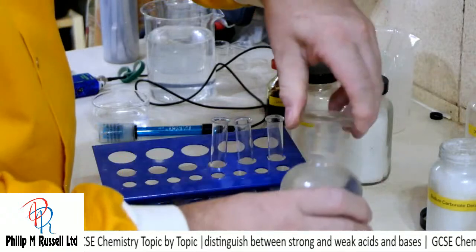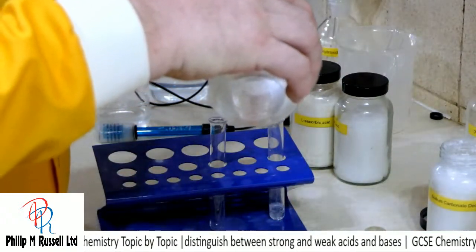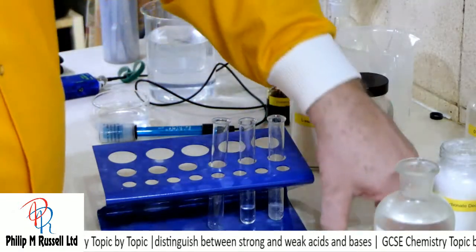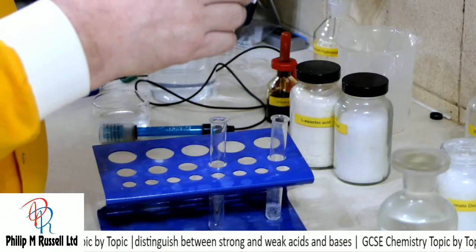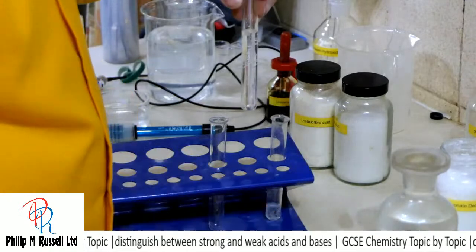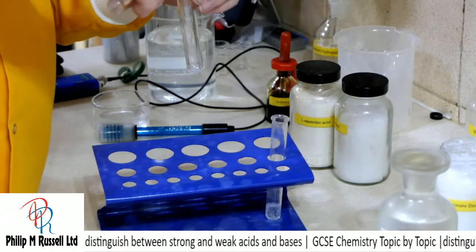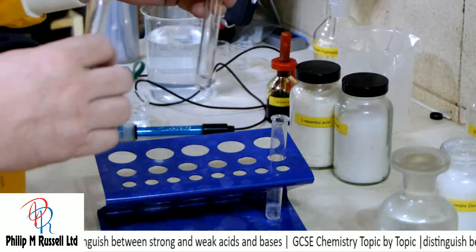Let's take this, let's put in here the same amount, but this time what I'm going to do is put in about 10 centimetre cubed of water, and then that's 10 times diluted. Let's put that one in there, so that's about 10 times dilution.